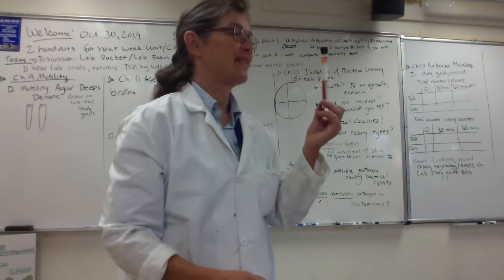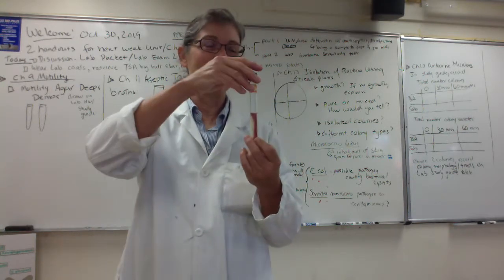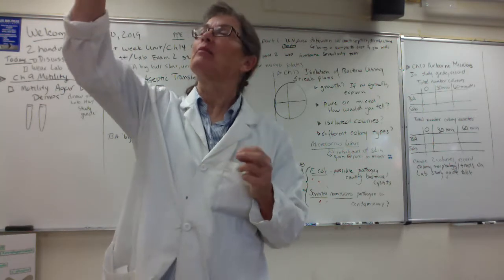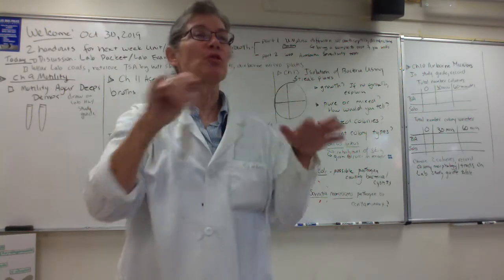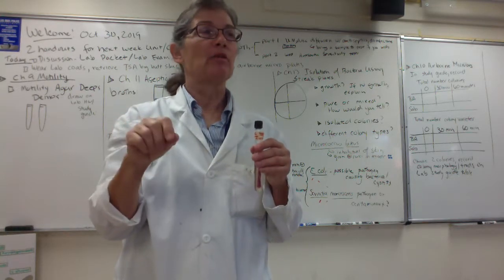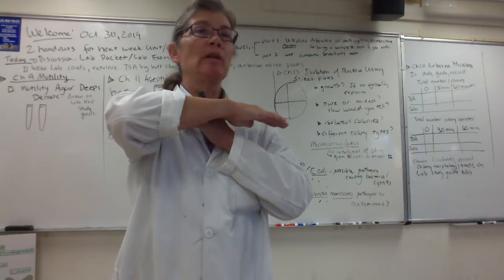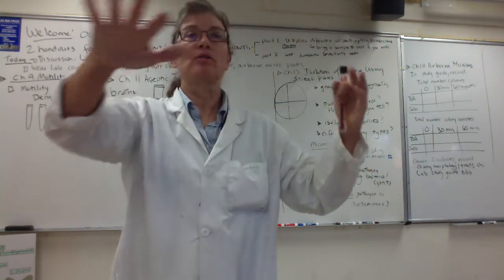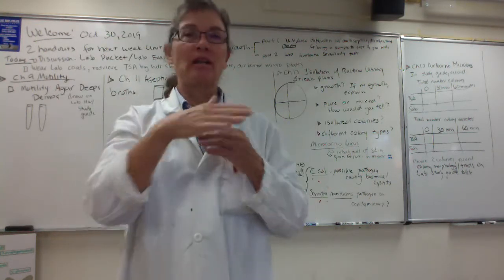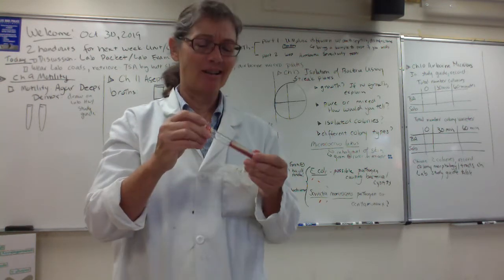Good, peritrichous, good. Using your handouts is awesome. Okay. And so indeed, the members of the genus Proteus are so motile. If you inoculate an agar plate with Proteus and incubate it, by the next day, they call it swarming, they would have swarmed over the entire surface of the plate. It's like a frosting of bacteria. So they're really challenging to get isolated colonies.